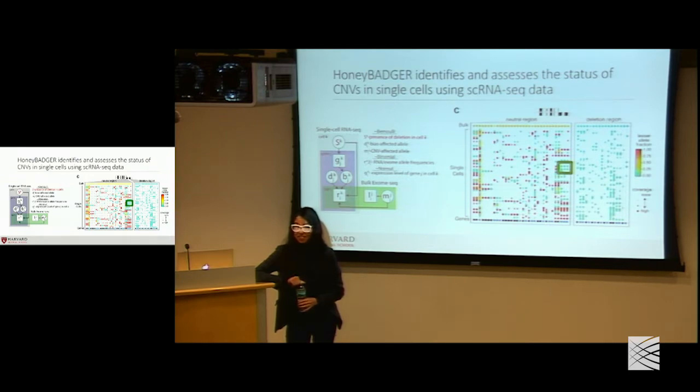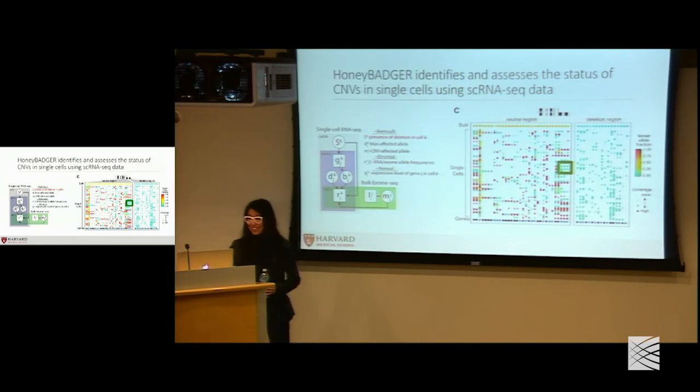That belief is based on the fact that in RT-qPCR, even when we're measuring the RNA level information, we do see both alleles. But if you were to prepare a library for RNA-seq, even for the same sample, then you can't see both alleles. So it makes me think that it's an issue of the reverse transcription or something about the single-cell RNA-seq library preparation. Could it be a timing issue, that it's stochastic and at any time only one of them is expressing at a high rate? That's true. Back and forth? Yeah, that is possible. Maybe in RT-qPCR we're capturing a longer time span. That's a good point. I don't know, so it'd be interesting for someone to find out.